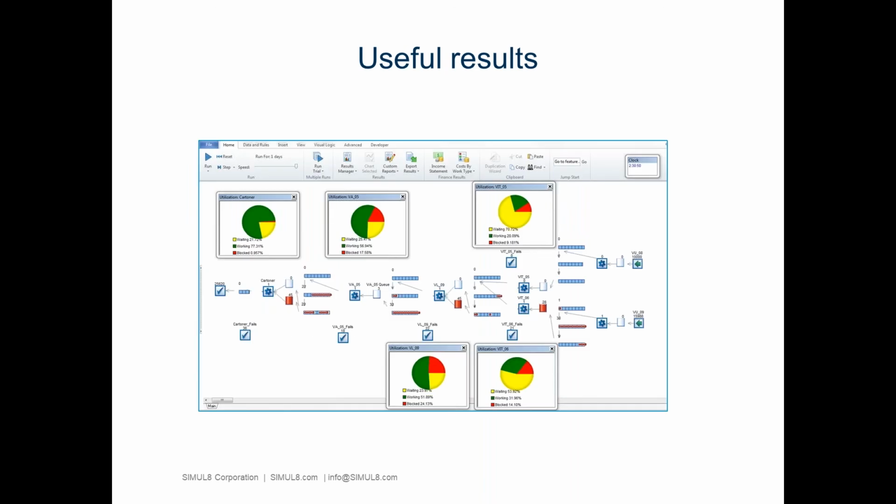We want to look at how long samples are waiting, and that can be based on different types as well. So you can have the maximum waiting time, the average waiting time, or crucially the time within a limit. When you have a target time to turn samples around, what percentage of the time are you within that, and when does that change at different times of the day?